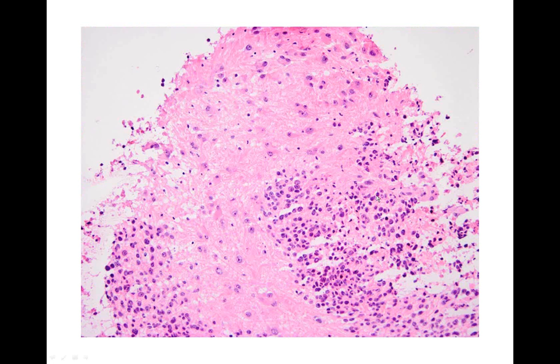So what you can see here is the lung cancer is here. Actually, there's islands of lung cancer all over the place. And this is the patient's brain tissue that's being beaten up pretty badly by the lung cancer. As we go to higher magnification, the cells are in these kind of tight sheets. They're very cohesive. This is a sign that it's actually a particular type of lung cancer called squamous cell carcinoma, which is more common in men than women. So it fits the history.